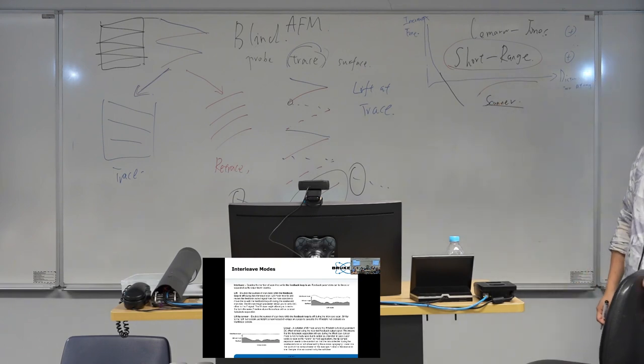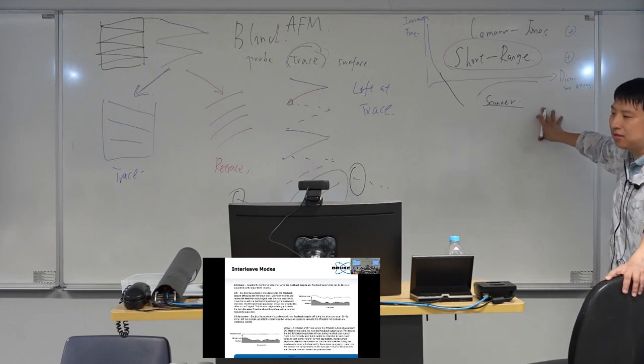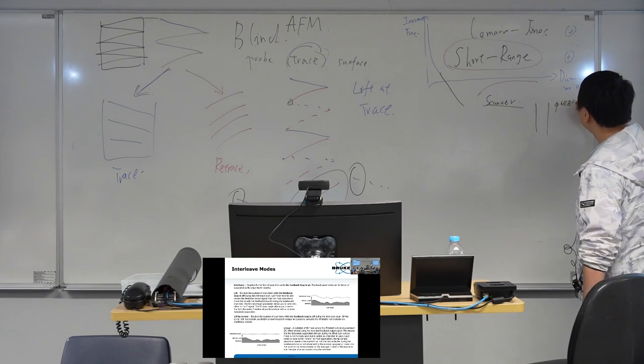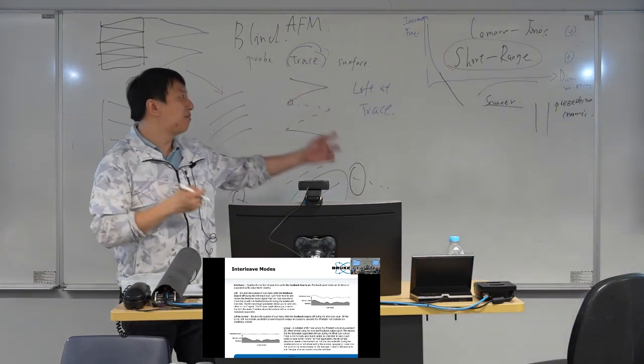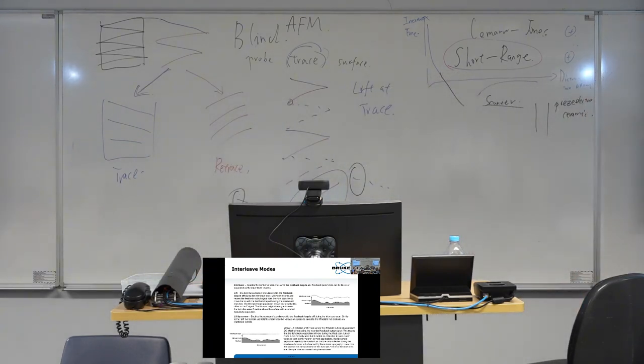And the scanner is in our AFM setup. We made this kind of scanner with the piezoelectric ceramic, the so-called piezo tubes, that's something like that. So this kind of piezoelectric ceramic, you guys know it very well. That's the piezoelectric response. We will go through that tomorrow.